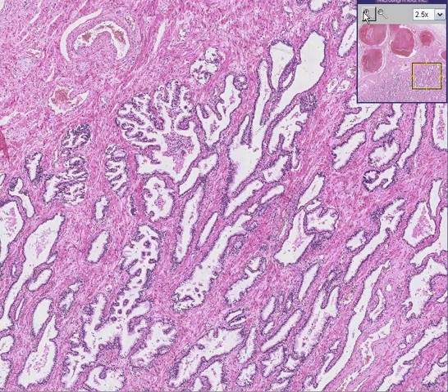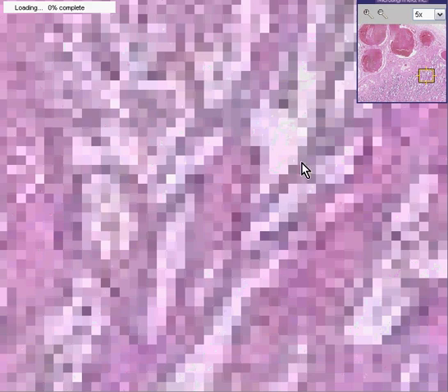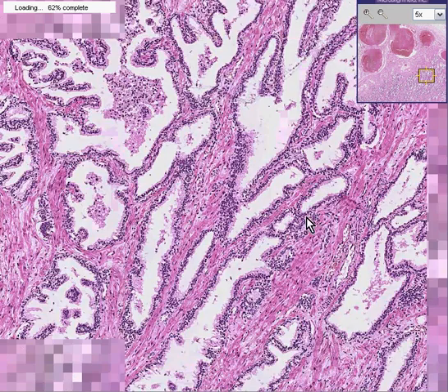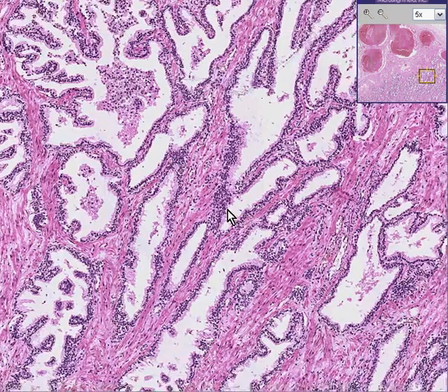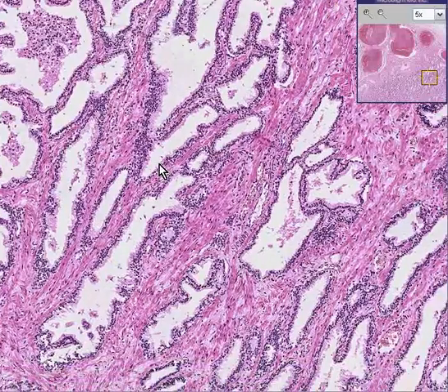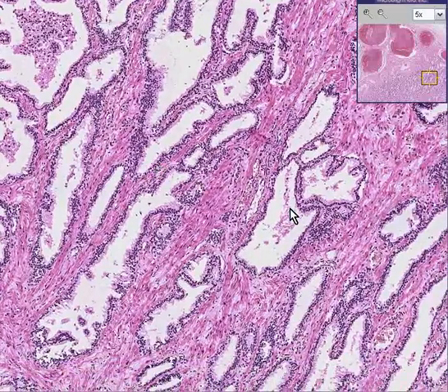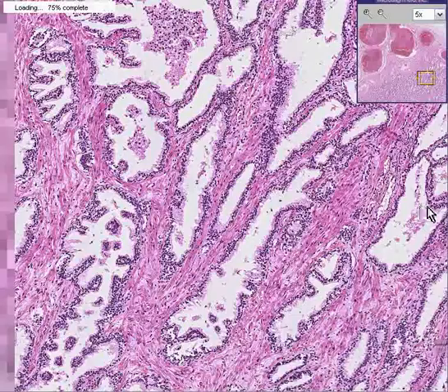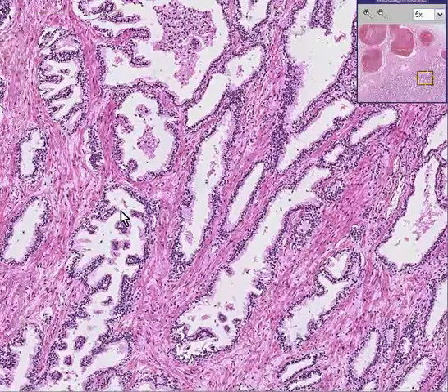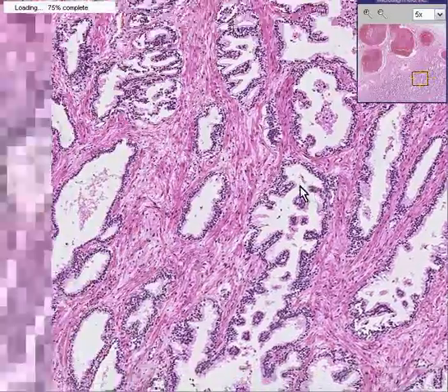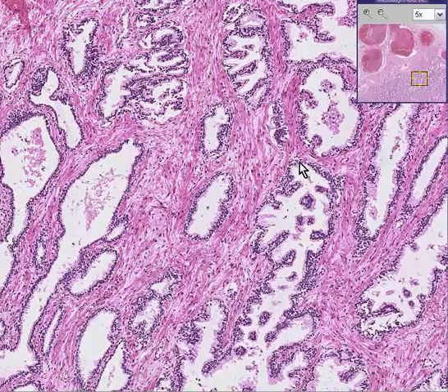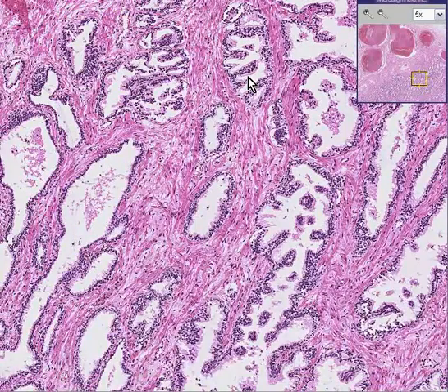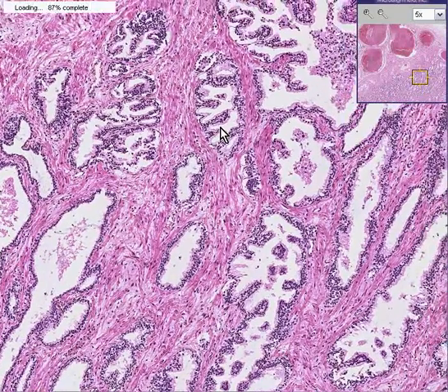In addition, you can see some secreted material within these glands. This is a classical appearance for a prostate gland.